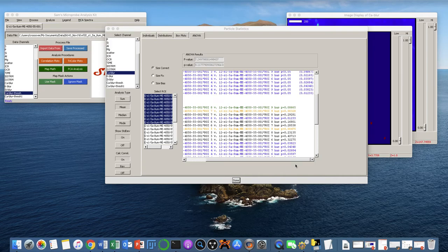Okay, so those are the 4 types of analyses you can do with the particle statistics package. When you're done analyzing your particle statistics data, just click Done to get out of this window. Note that if you want to reopen the particle statistics package, SMAC will redo all of the calculations. You'll come up with the same calculations, but this can be a bit time consuming, so I recommend saving and exporting the data that you want before you click Done.